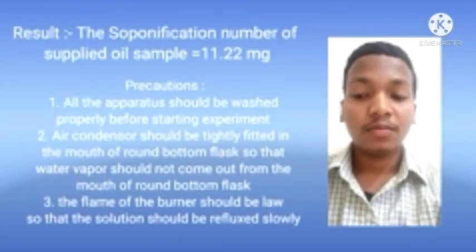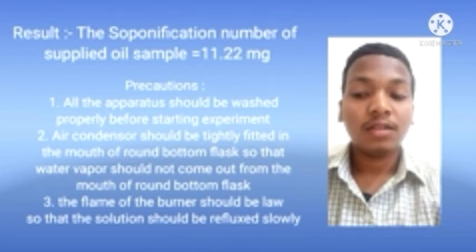Result: the saponification number of supplied oil sample is 11.22 mg.